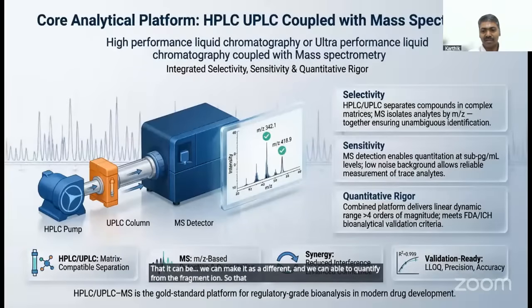So that is the MS technique we are going to use. With these both together, HPLC and MS, it ensures unambiguous identification.